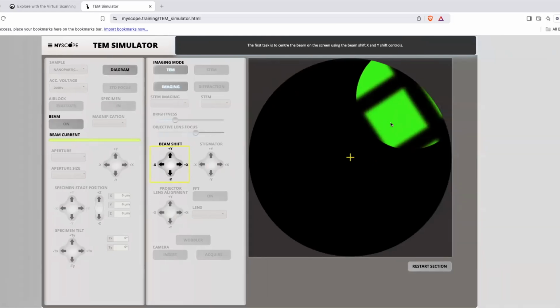This is a transmission electron microscopy grid, TEM grid. It is made up of copper or gold or nickel. It can also be silicon nitride. These grids have a very thin membrane where your nanoparticles are loaded, and these membranes are between 5 and 30 nanometers.